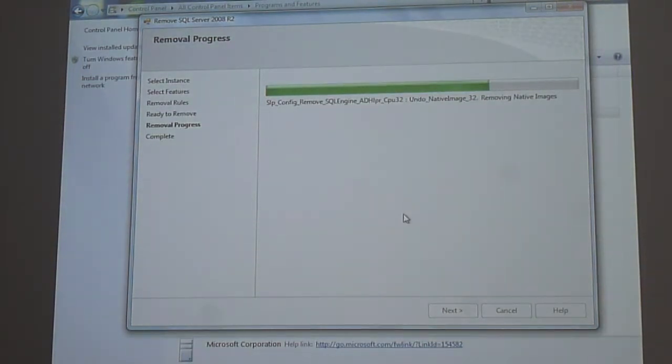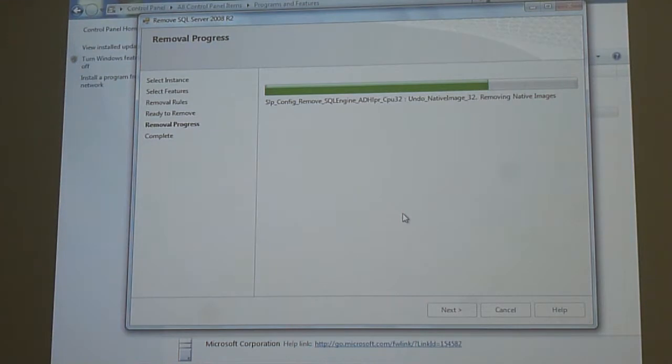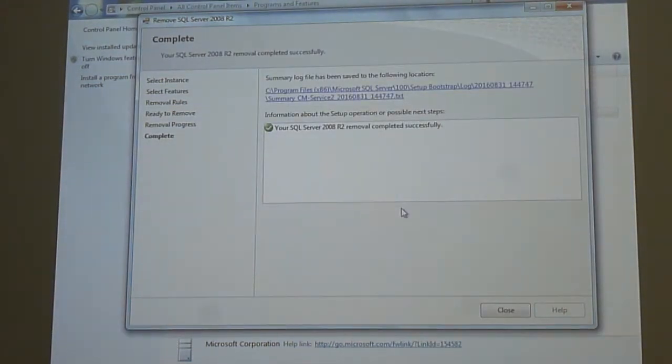You have to requalify everything or so. So they have to be okay. So talk to them in advance about what you're going to do, and then they have to say yes, okay, and then do that.